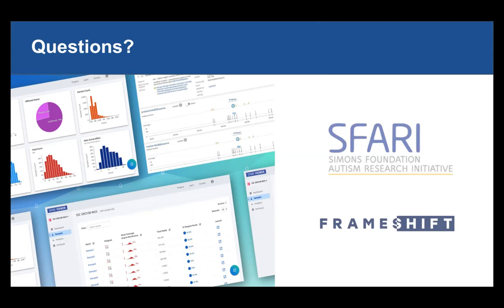In the meantime, while we're waiting for questions from the audience, I'll start by asking one. So Alistair, I think you showed us 2 of these apps that are available through SFARI Viewer. Are there any other apps that are available? Yes, there are. So the whole tool is built on top of an API, a programming interface that allows us very easily to connect different tools in. So we already have a number of different web applications that are available.